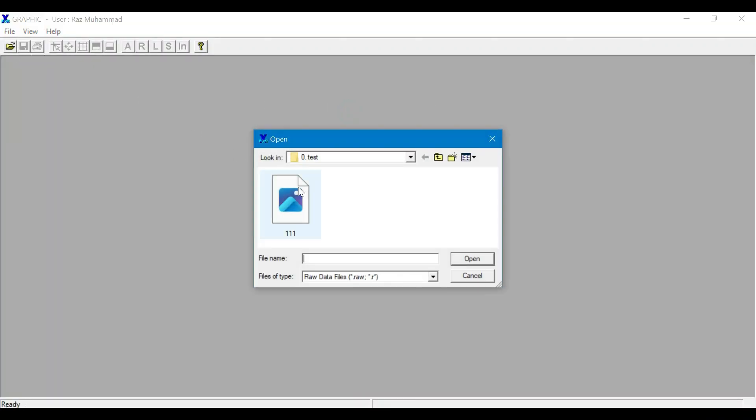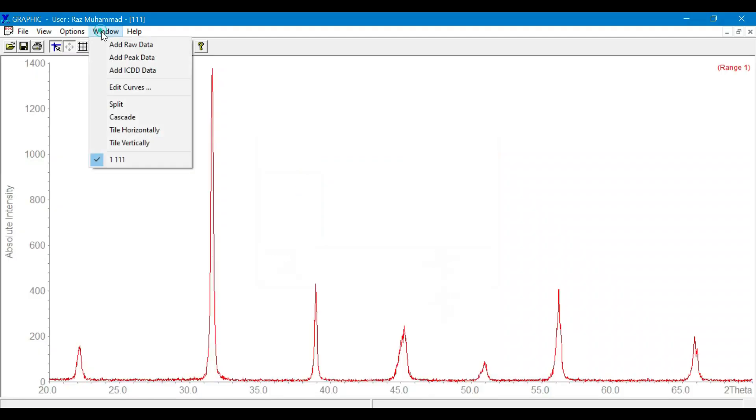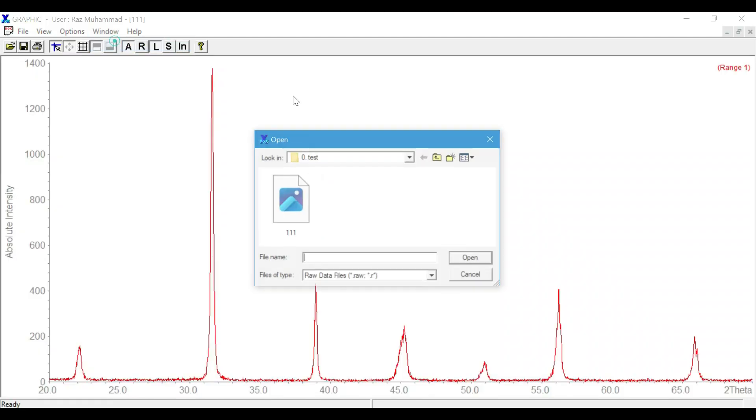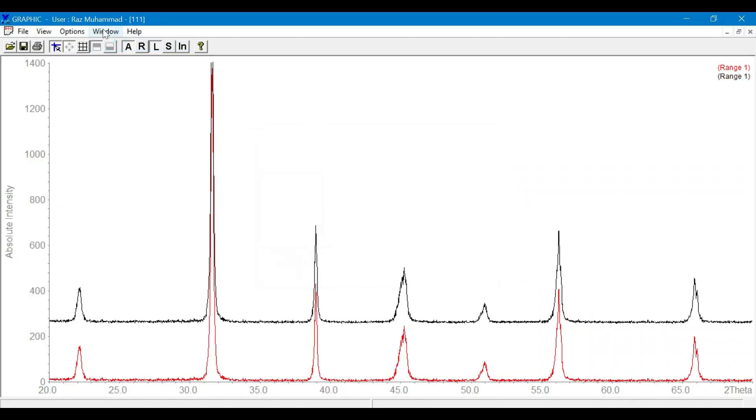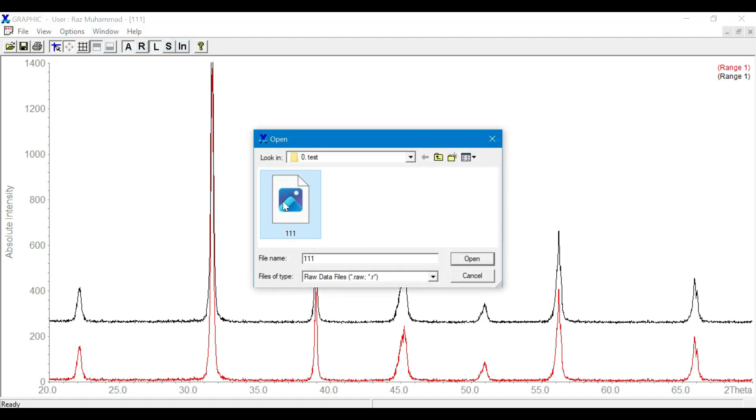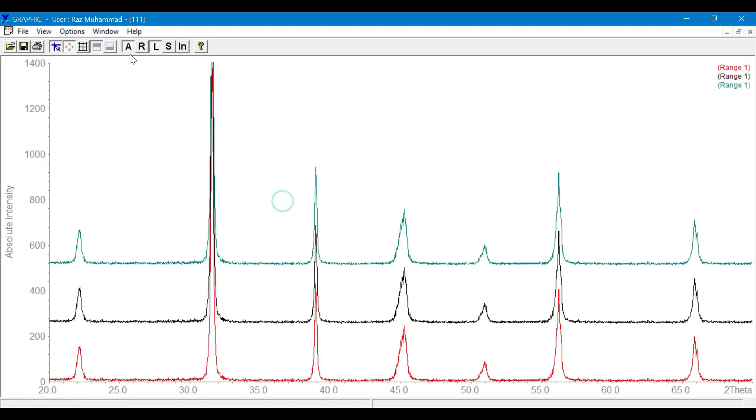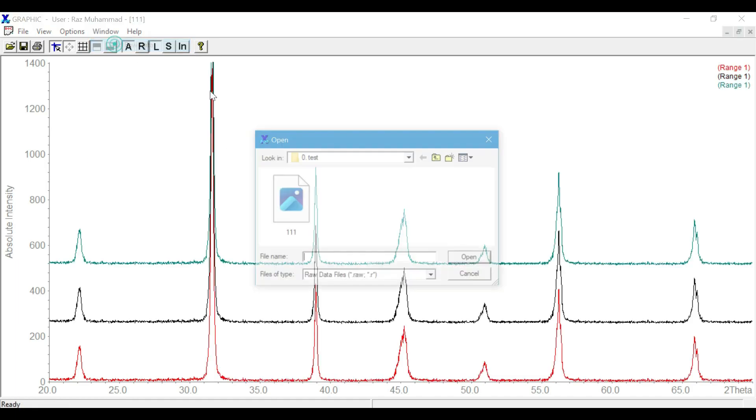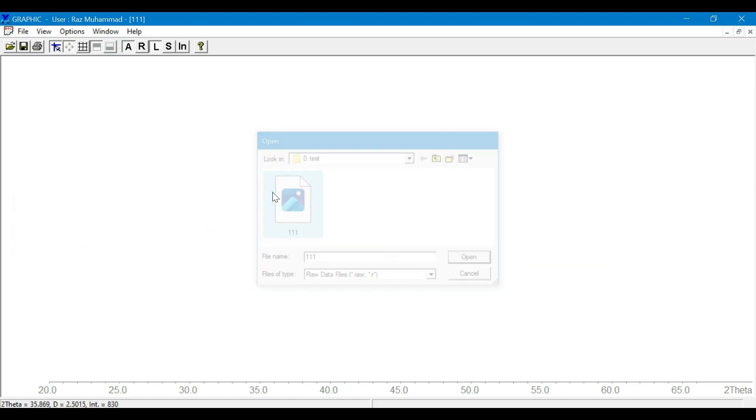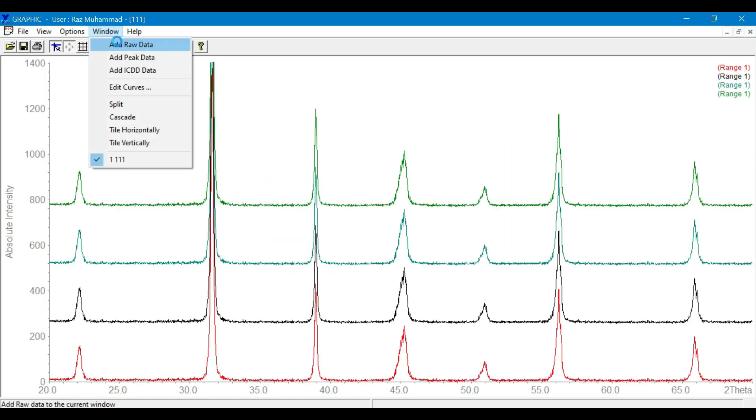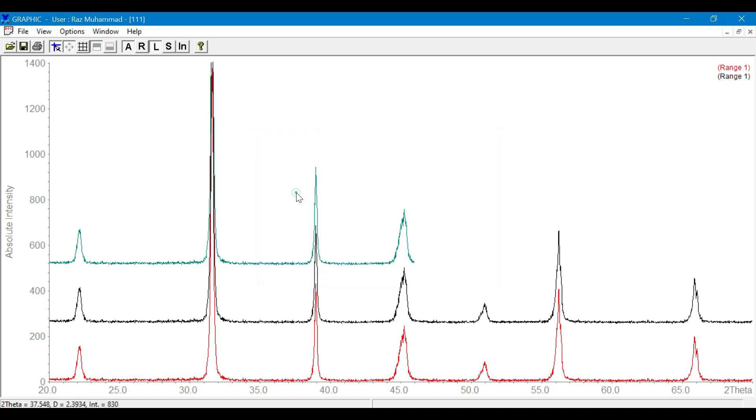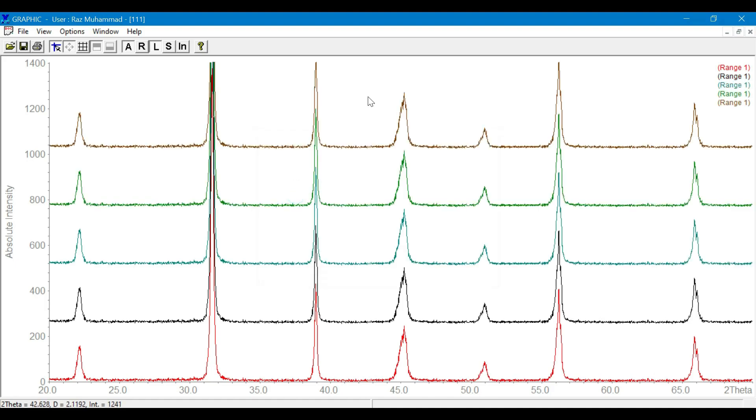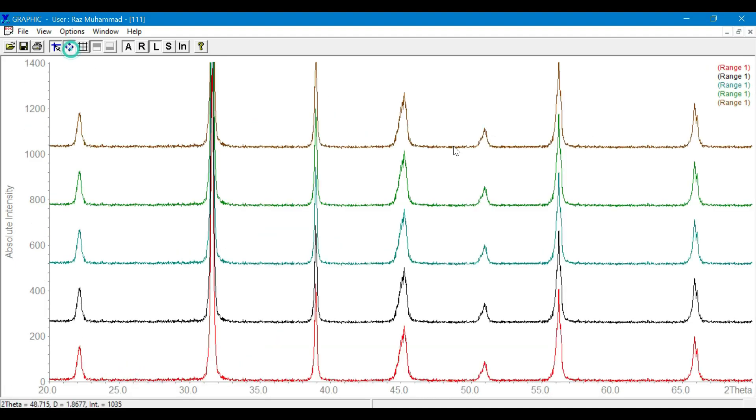If you have doped your host compound with any kind of cation, you can go to the graphics section and plot them together to compare whether there is any peak shift towards lower or higher two theta angles, which depends on the ionic radii of the constituents.